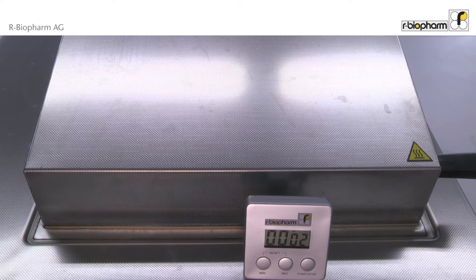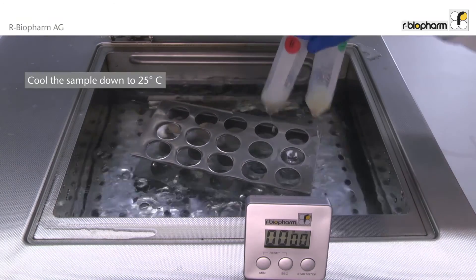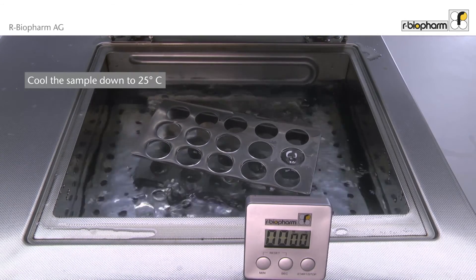Incubate the samples for 10 minutes in a boiling water bath. Make sure that the water is boiling. Then cool the sample down to at least 25 degrees centigrade.